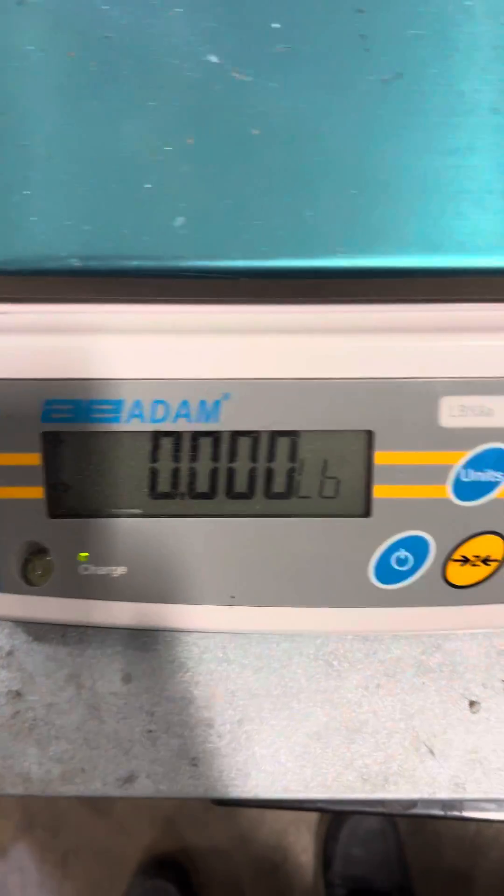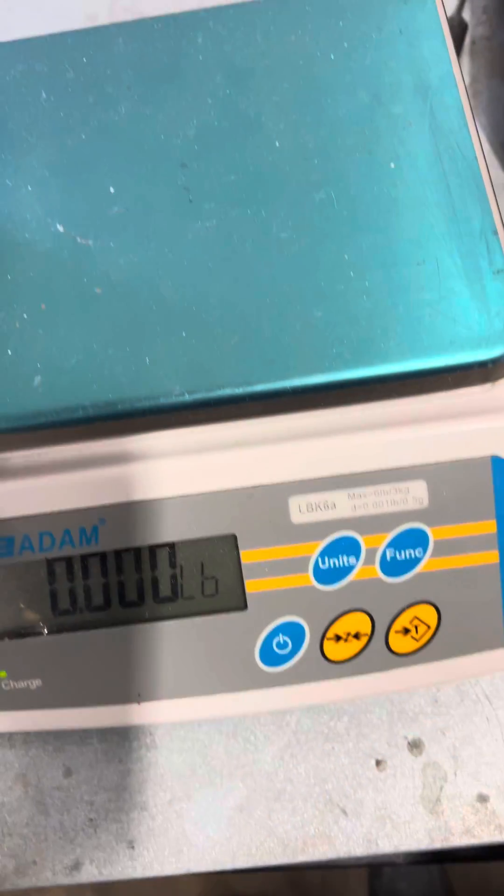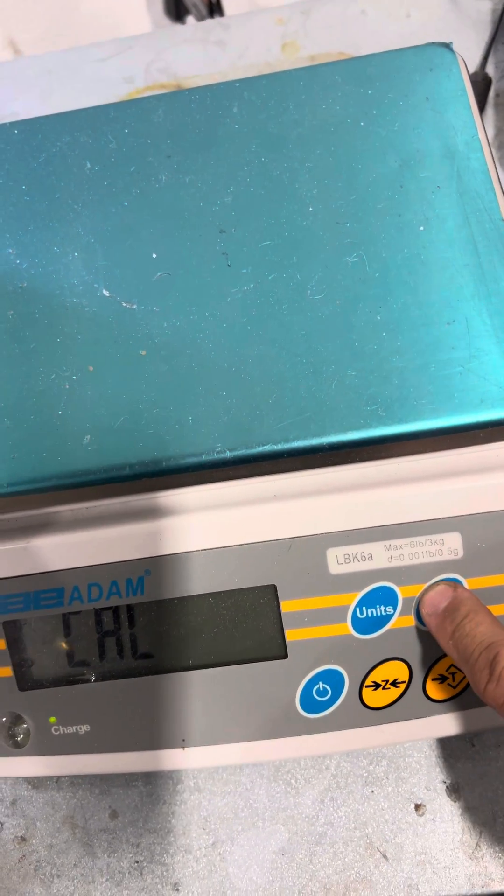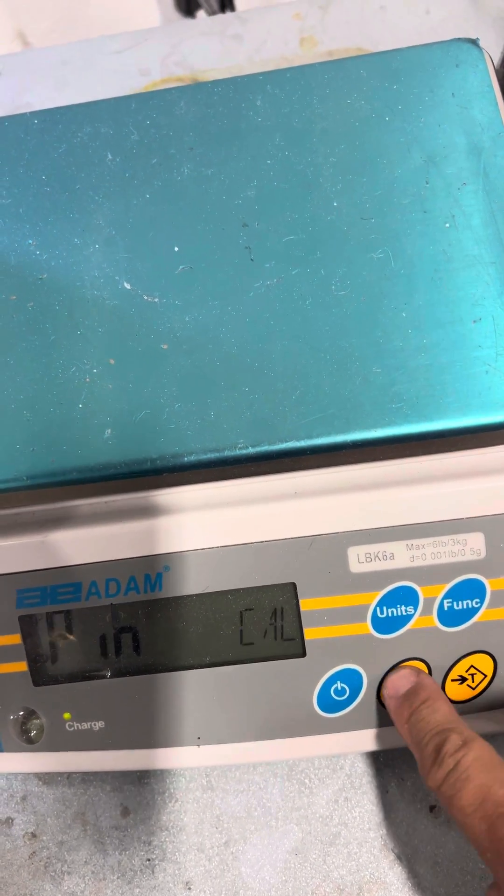This is a calibration adjustment of the Adam LBK. Basically, press the function key until you see Cal, then press zero.